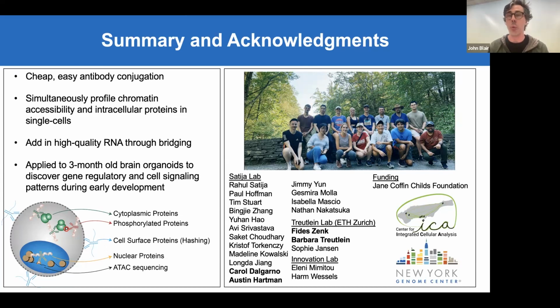So when you're quantifying these proteins, it has to be relative to other cells within the assay. I wouldn't suggest saying this cell type was high for this marker in this assay, and in a parallel assay it was lower in a different cell type, therefore we can compare the two. Unfortunately, everything has to be relative within the assay itself.